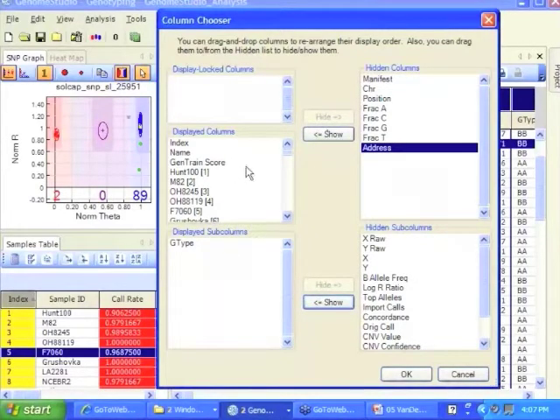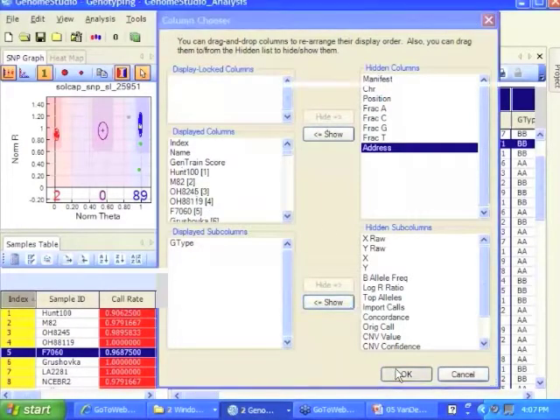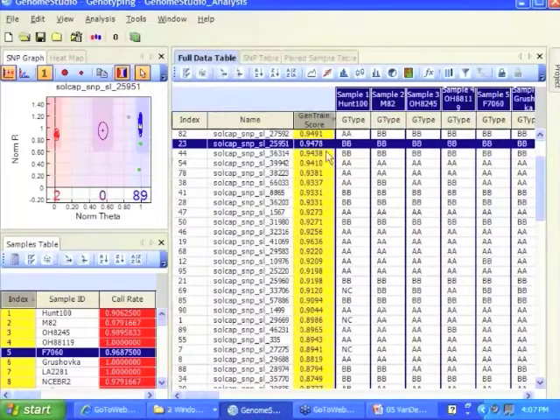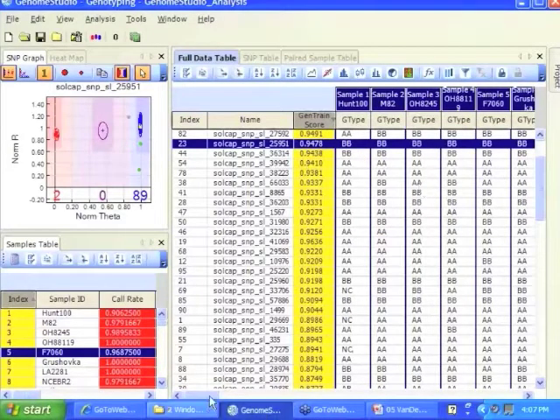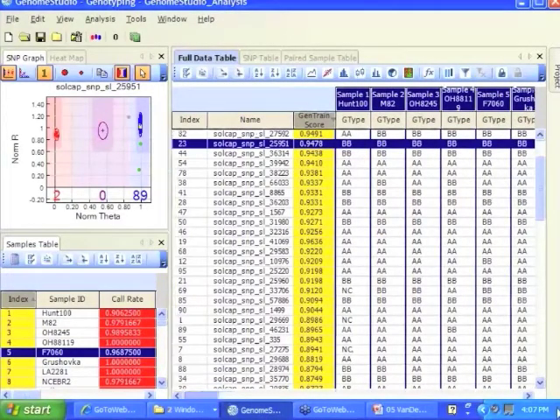So I want to see right now just my samples and the genotypes. So I'm going to hit OK, and that's what I see, so this is what I'm going to export. This is all I'm going to export and I'm going to have 96 samples over here.